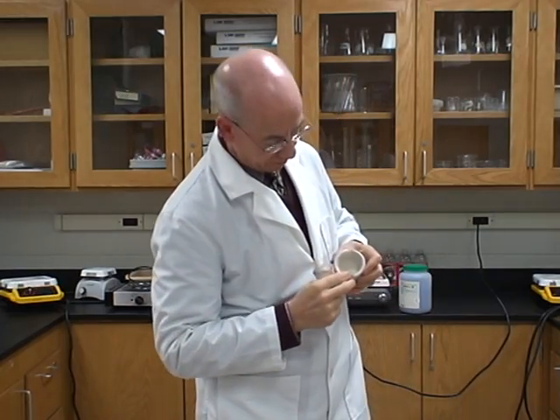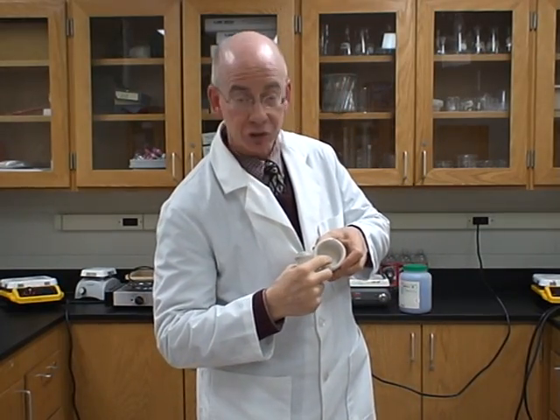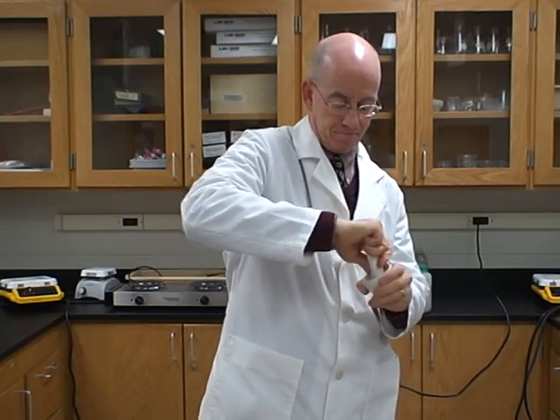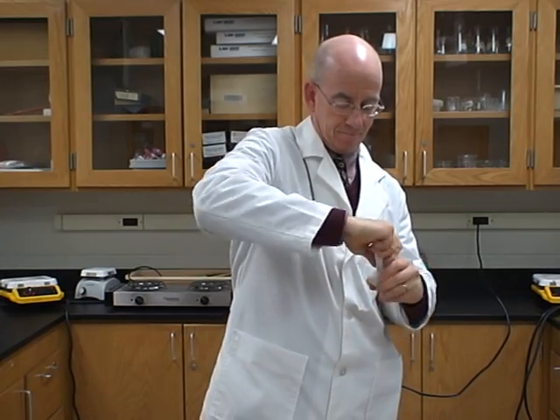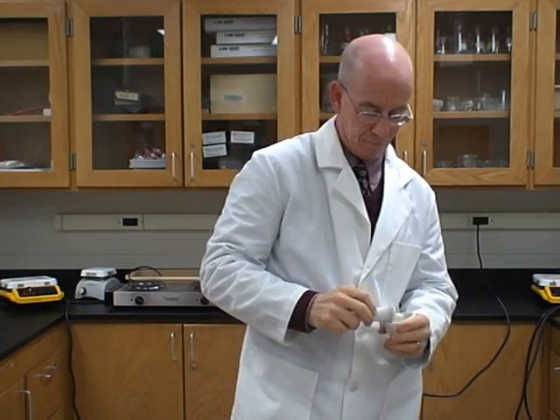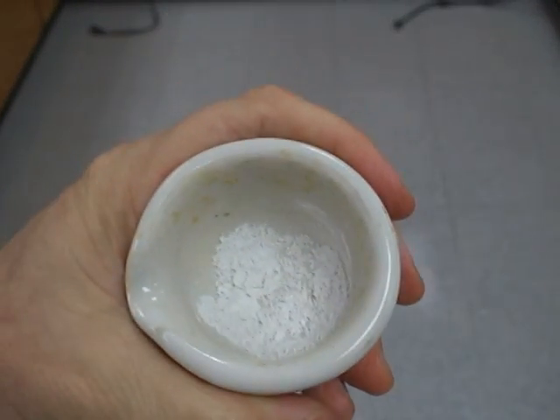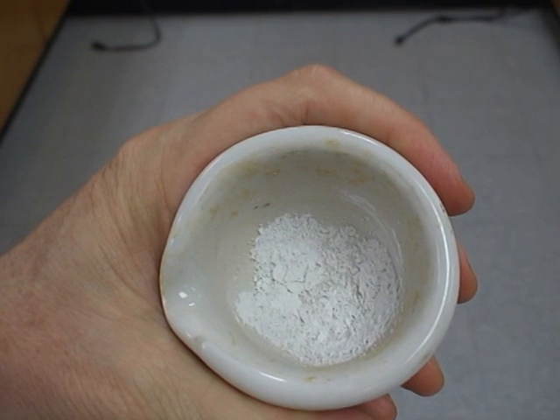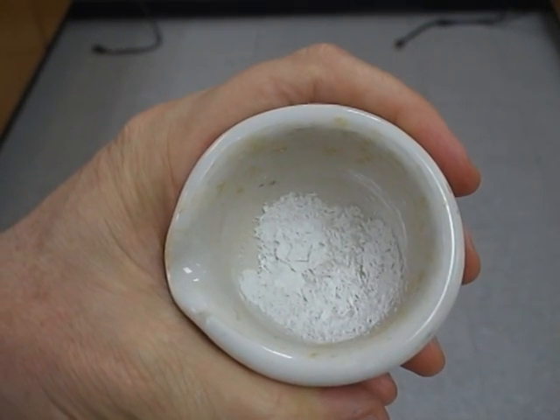The next example is using a mortar and pestle. And what I did, you probably can't see it on the camera, but I put salt crystals in this mortar, and I'm just going to grind them up. It's called mortaring. I'm going to grind them all up in there. Now you can look in there and you can see it's all powdery. It was crystallized. Now it's kind of like fine powder.